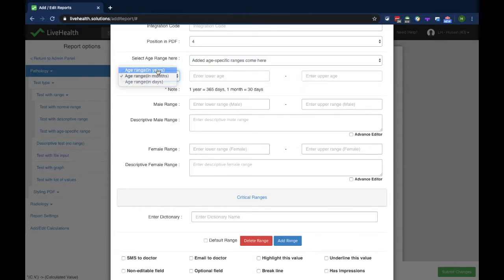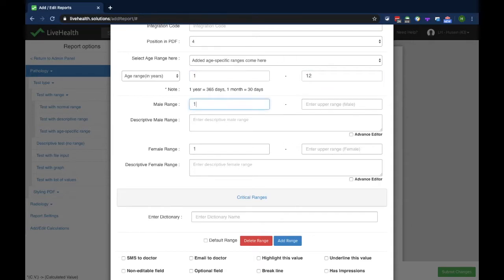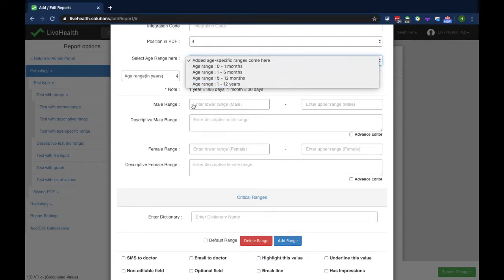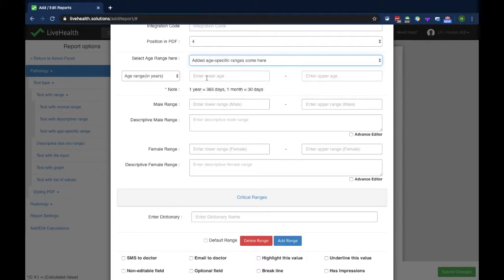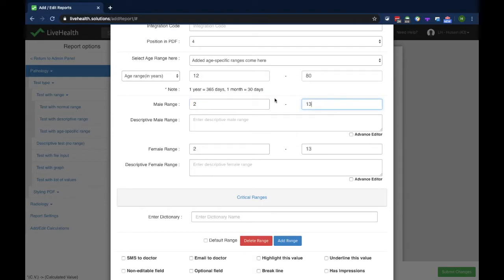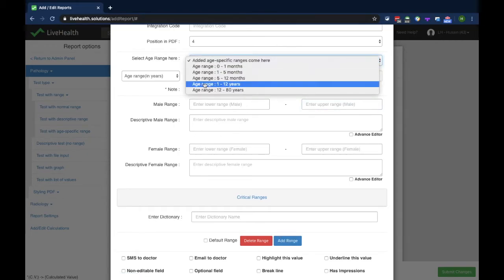Next I'll add a range from 2 years to 12 years with a value of 1 to 5, then from 12 years to 80 years. After clicking add range, all ranges from 0 days to 80 years have been added.